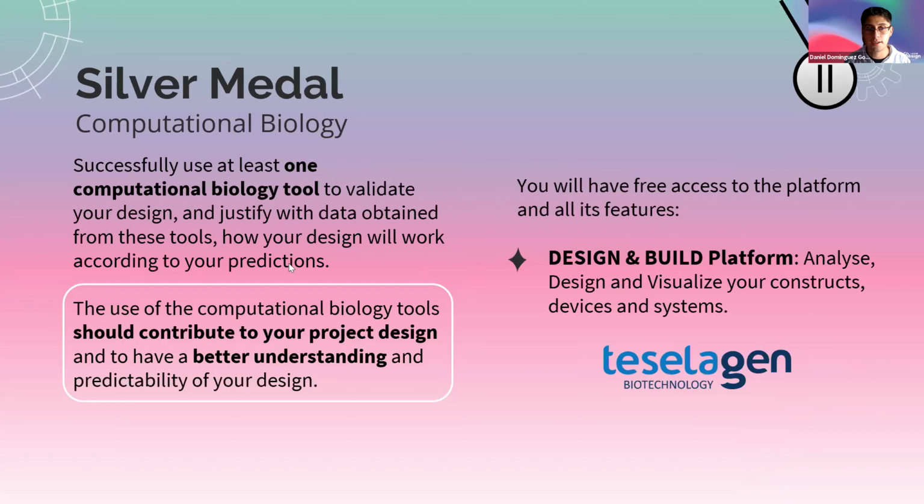It requires you to use at least one computational biology tool to validate your design, to help you design your constructs, your genetic circuits, genetic devices, and also to gain more information on your systems. So, as you know, you will have access to these features, and we will be there to help you during this process.